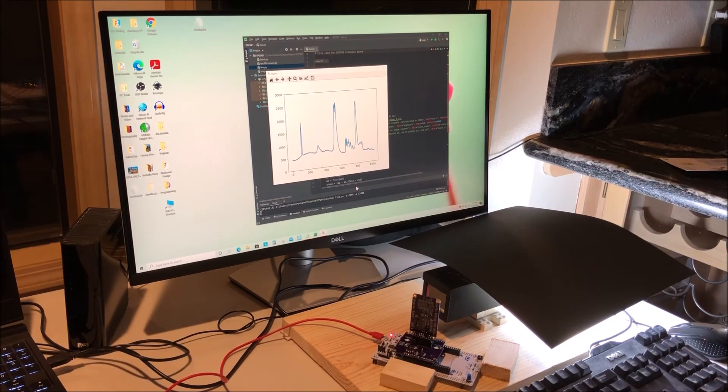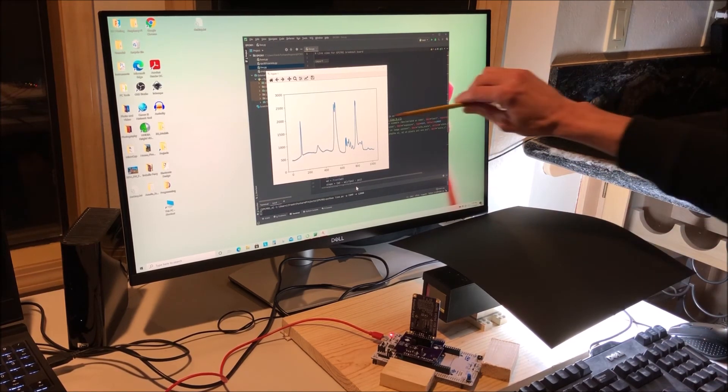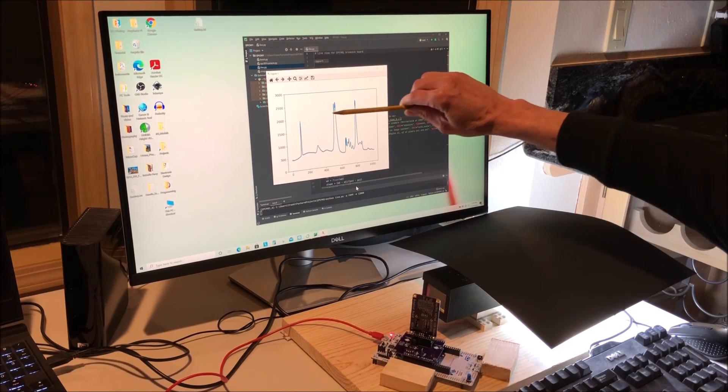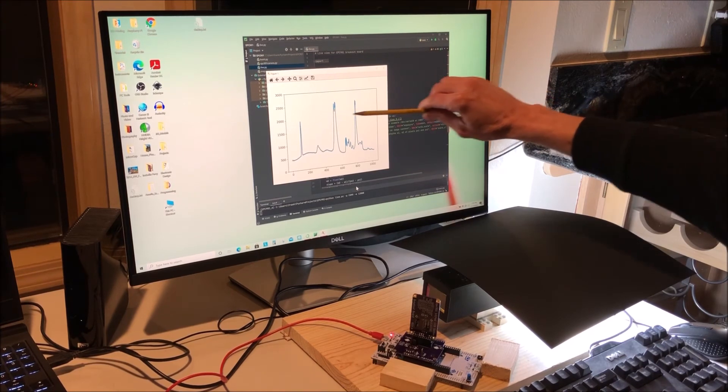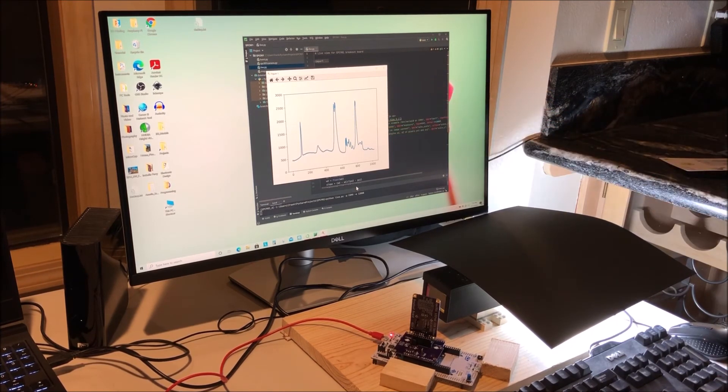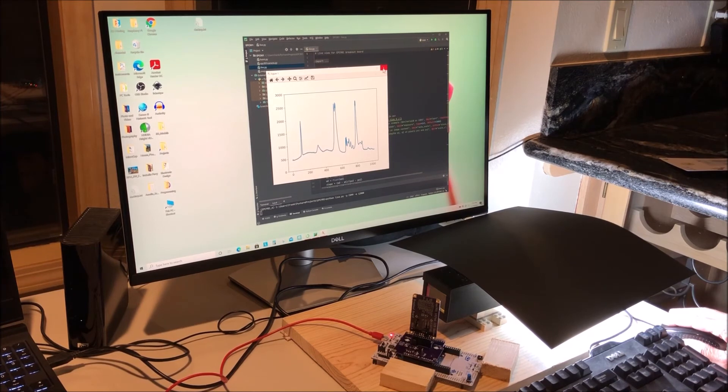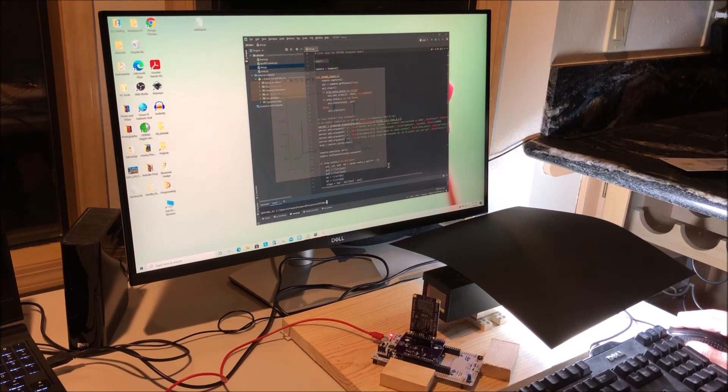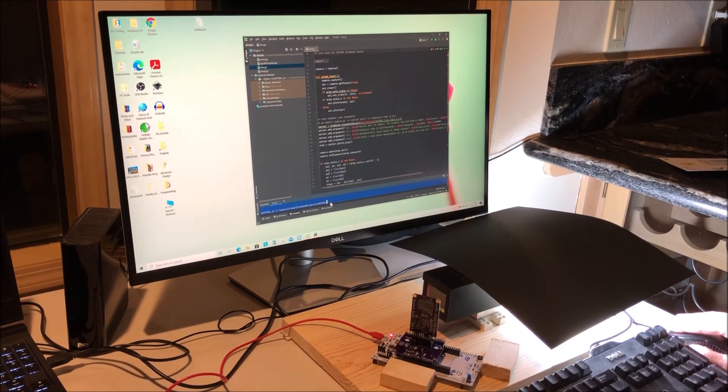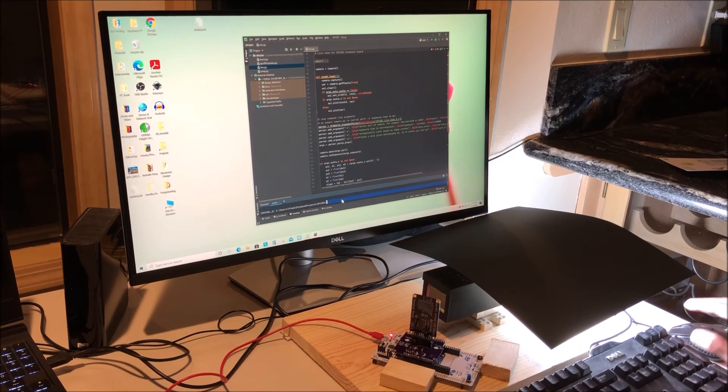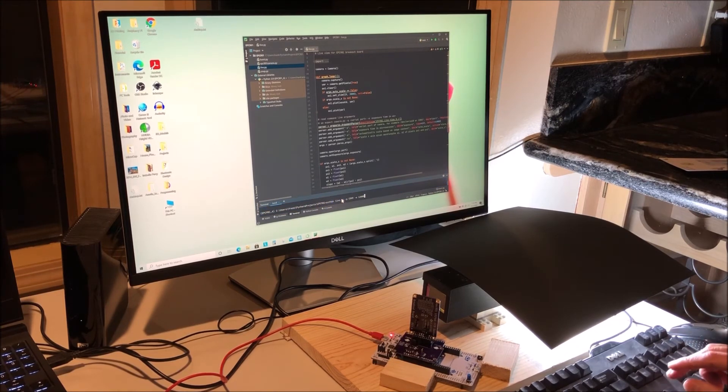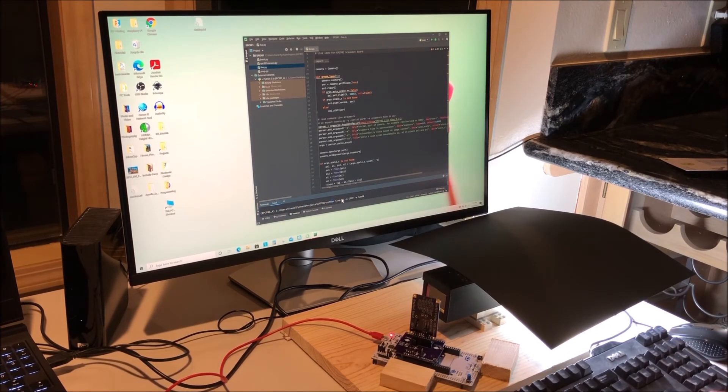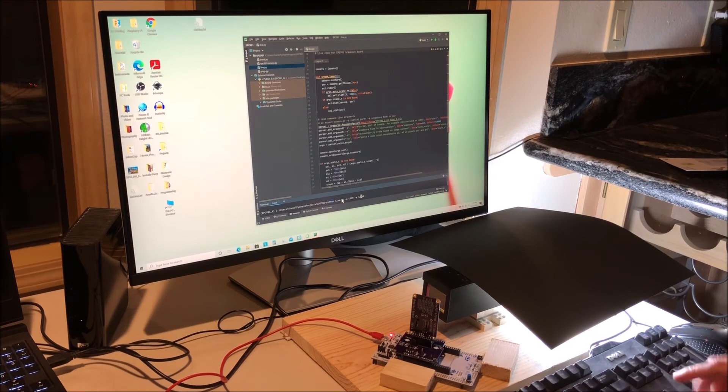But I do need to set the exposure. It's showing clipping right up here at the top. To do that I'm going to go back to the terminal line here. We had that set at 12 milliseconds. I'm going to change it to 6 milliseconds.